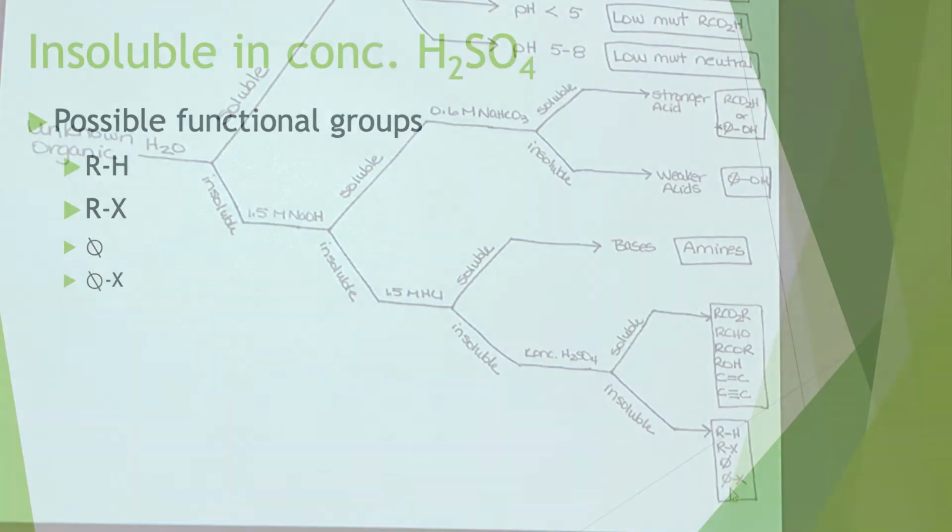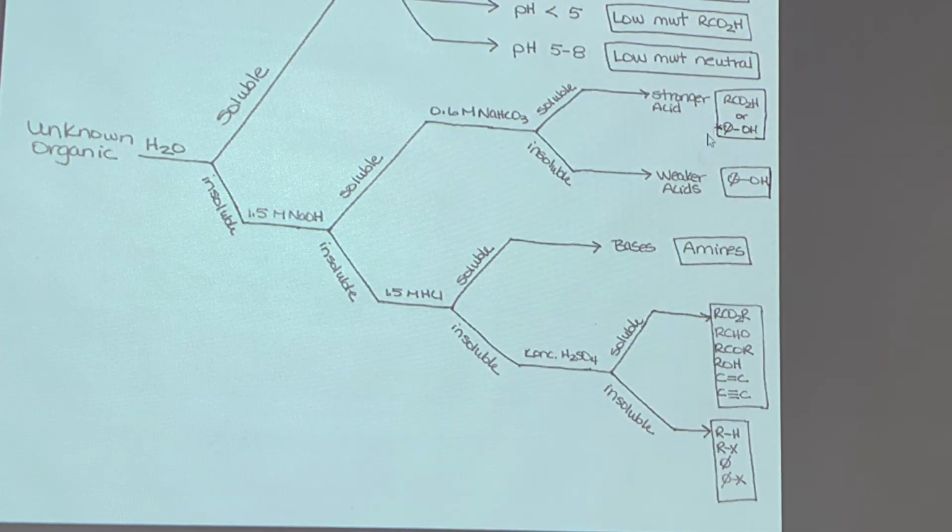So once I go through the solubility test, let's say that I think it's one of these classes, then there's no reason to do a chemical test that would not involve these. I only want to focus on the chemical tests that would involve these particular classes of compounds.